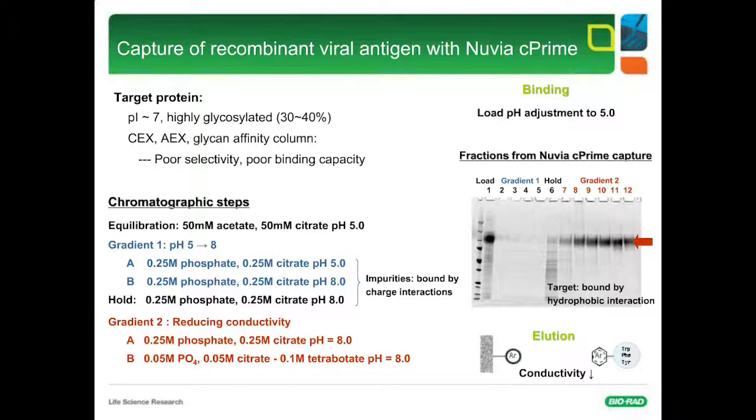I see. Okay, it may have something also to do, I guess, with the base matrix that the ligand is on. Yes. Although this is pseudo-affinity, the base matrix does play a role. As we develop resin products, we've noticed that different matrices still have an impact on tailing, irrespective of whether developing affinity or sort of pseudo-affinity. Yeah, it could be due to the mass transfer efficiency for the molecules to get in and out of the matrices. Right, I see.